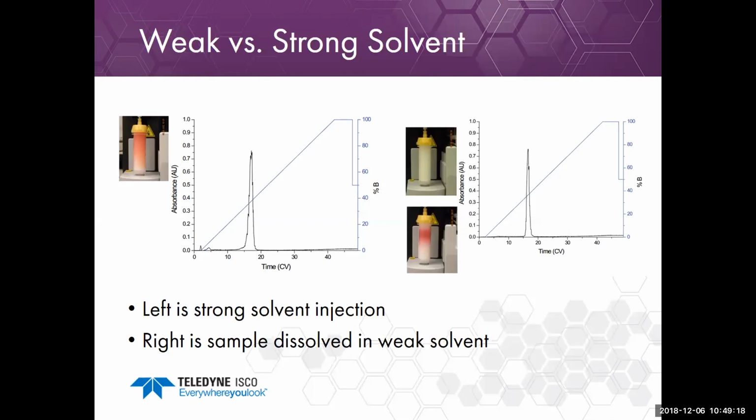Okay, what is the technical difference between analytical and preparative HPLC and how to develop an analytical to prep method development? The technical difference is analytical is really intended to look at analysis. Is the compound pure? How pure is it? But it tends to run very quickly.